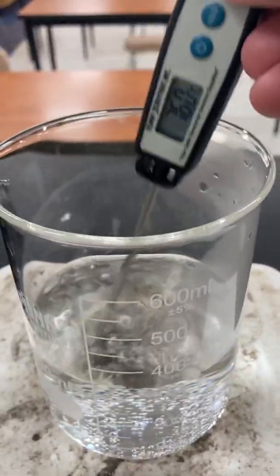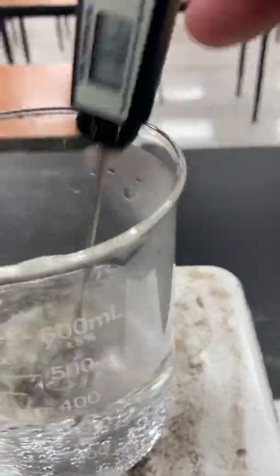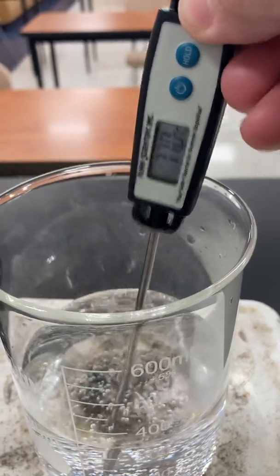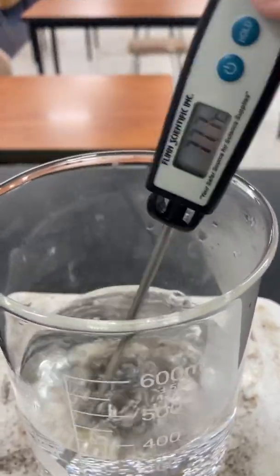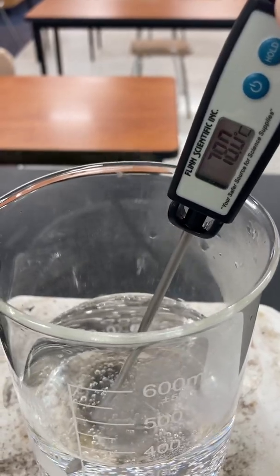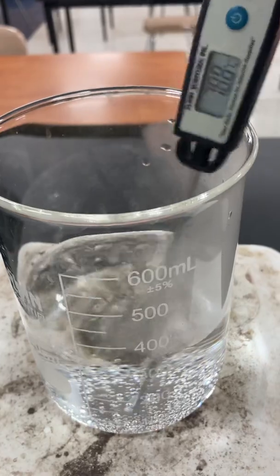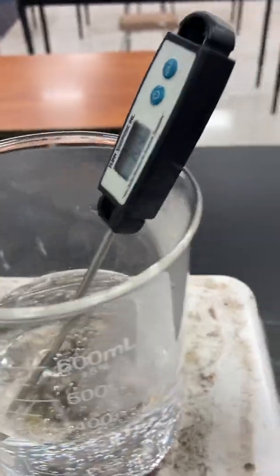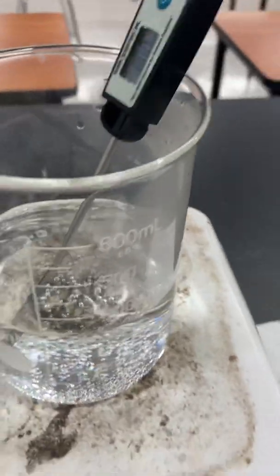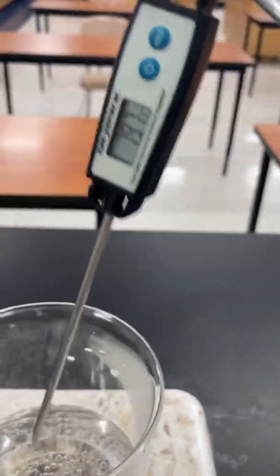Okay, we're getting more bubbles on the bottom. Okay, at 9:30, we're at 77.8 degrees Celsius. I'm gonna go like this for a sec and start holding it with the tongs.